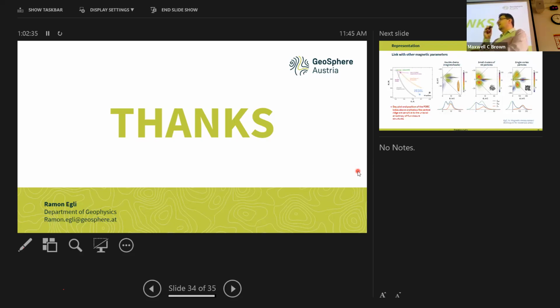Imagine that the VSM is controlling the field with a resolution that is compatible with the Earth's magnetic field. And now we have stray fields from an elevator, for instance, nearby. This can affect the field control, in the sense that the field is measured in one pole cap, but the sample is not sitting on that pole cap, it's sitting a little bit away from it. And if you have a field gradient, there is a discrepancy between the applied field and the real field. These are two things that come to my mind. There might be many others that the lecturer probably knows better than me.